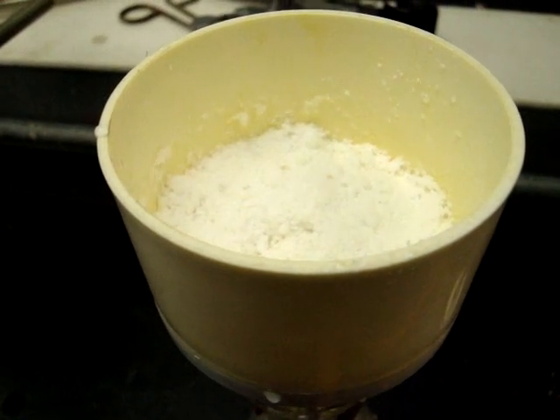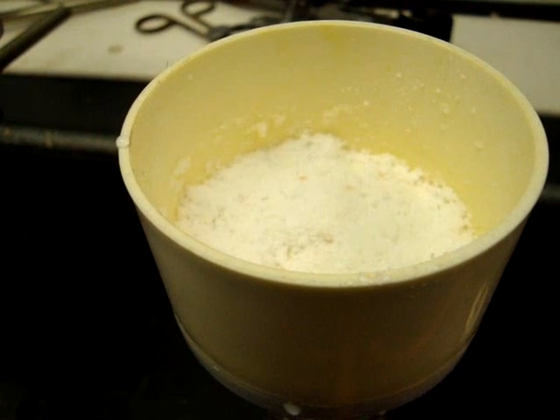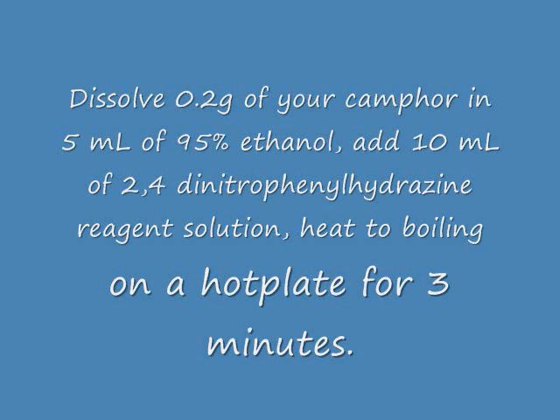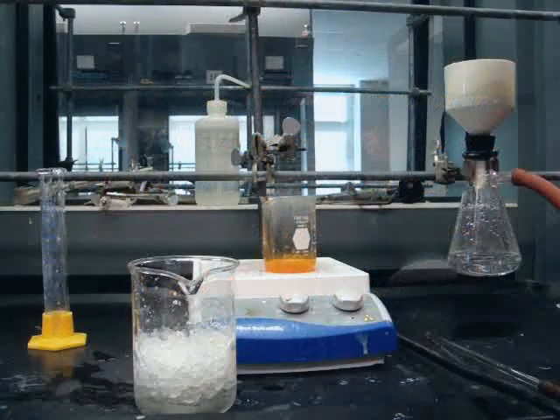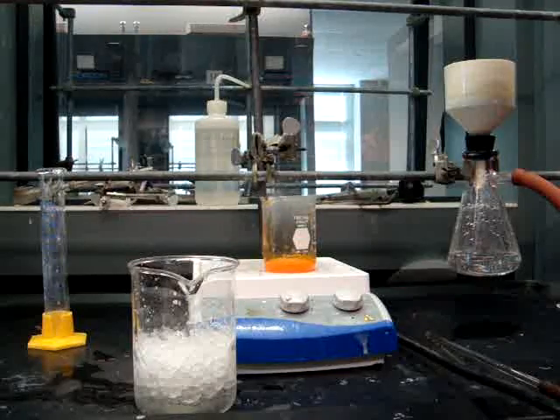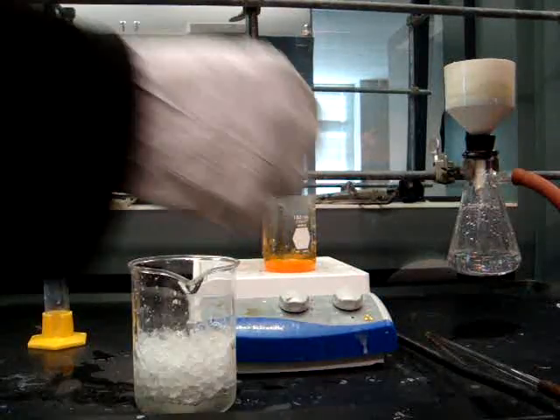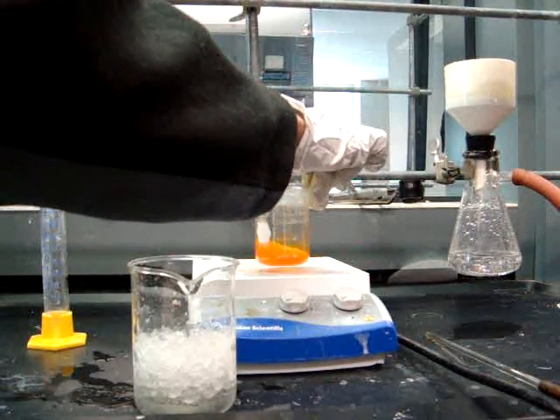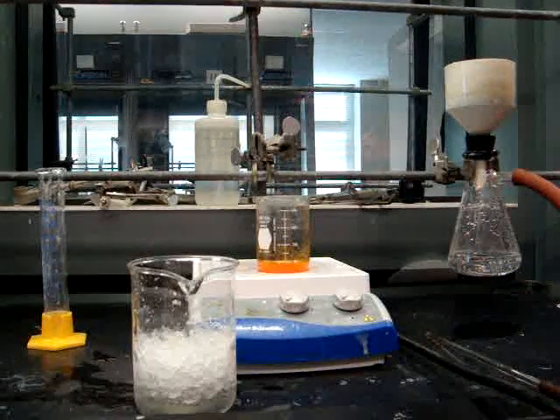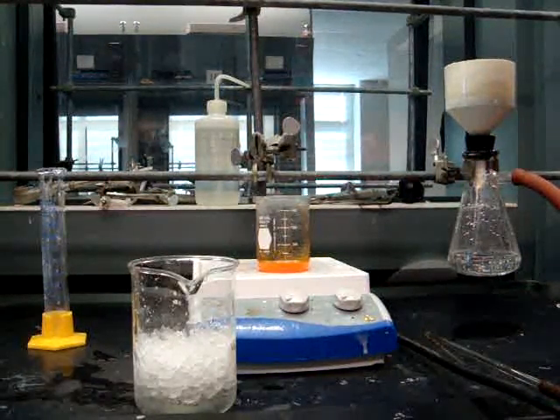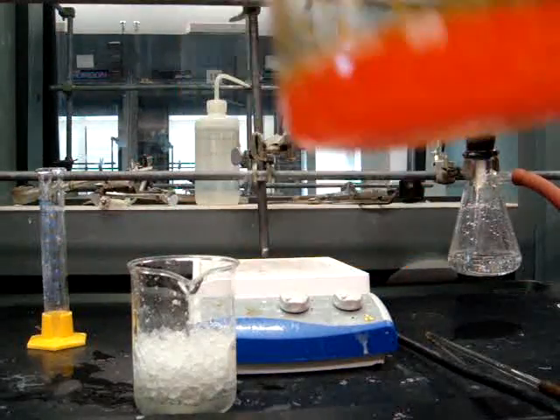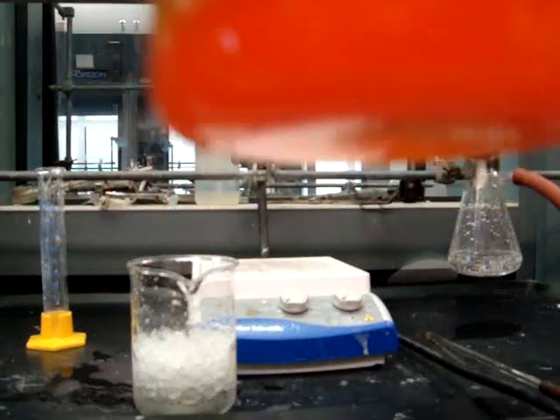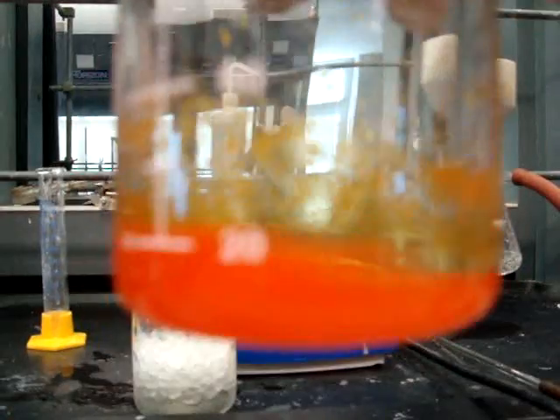You'll be dissolving 0.2 grams of your camphor in 5 milliliters of 95% ethanol and 10 milliliters of 2,4-dinitrophenylhydrazine reagent solution. As you can see, we're heating the mixture on a hot plate for 3 minutes to its boiling point. The solution will turn deep yellow or yellow-orange. And as you can see, the yellow crystals are starting to form on the outside of the flask.